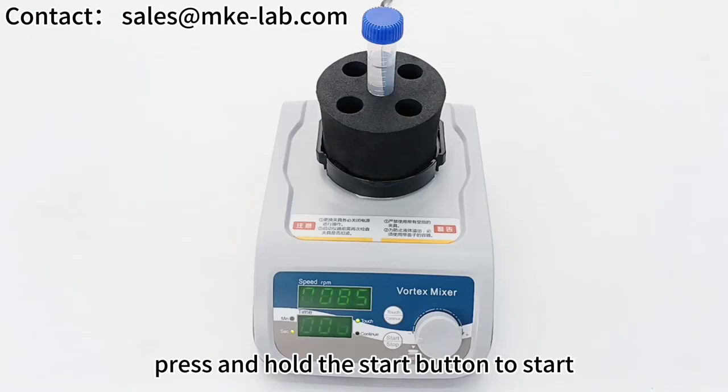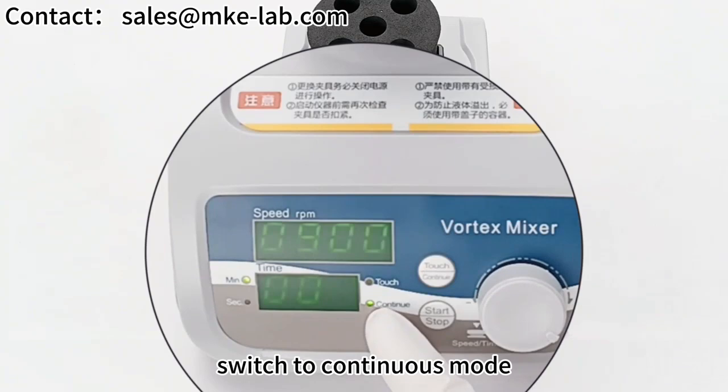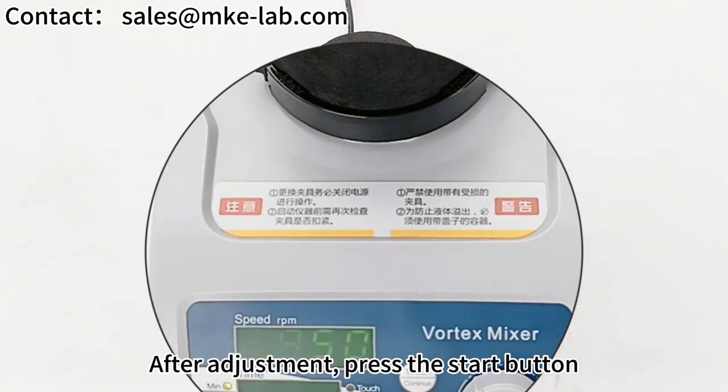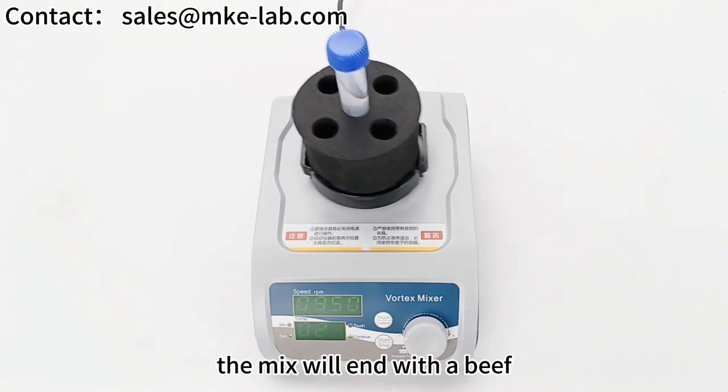Press and hold the start button to start; release the button to stop the device. Press the touch continue button to switch to continuous mode. Press the lower knob to set the mixing time after adjusting the speed. After adjustment, press the start button — the device enters the running state. The mix will end with a beep.